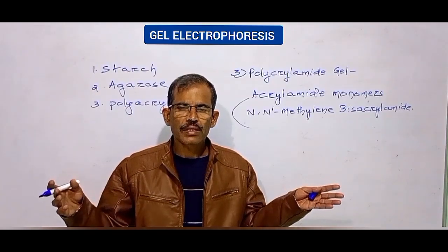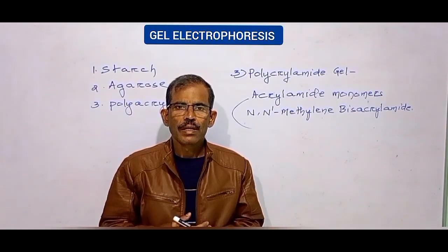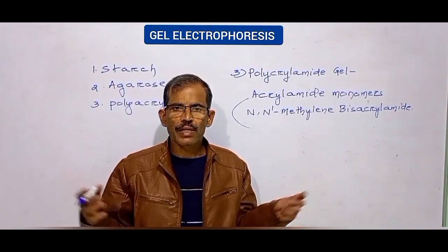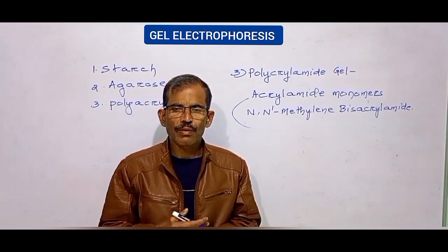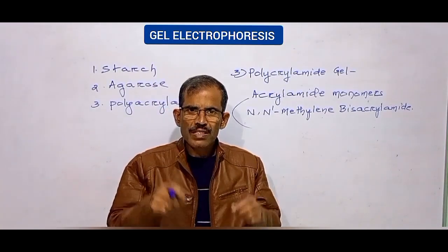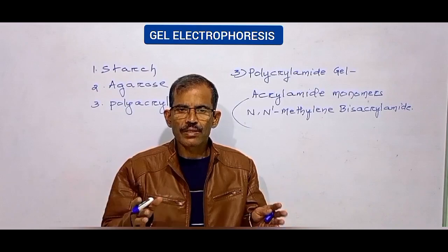Low percentage acrylamide gels are also used in the separation of nucleic acids. Acrylamide gels with a content between 10% and 20% acrylamide are used in SDS polyacrylamide gel electrophoresis, where the smaller pore sizes introduce a molecular sieving effect that aids in the separation of proteins based on their molecular size.